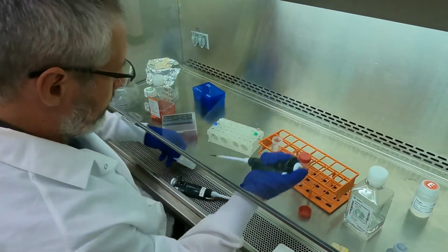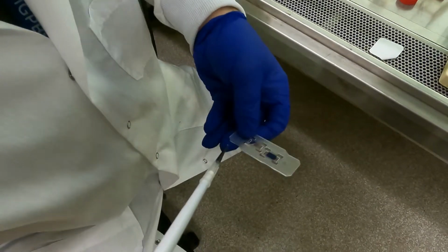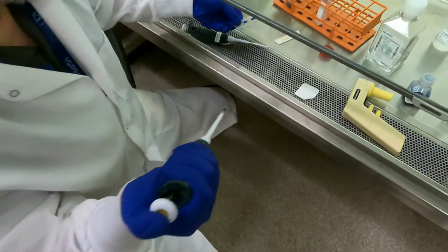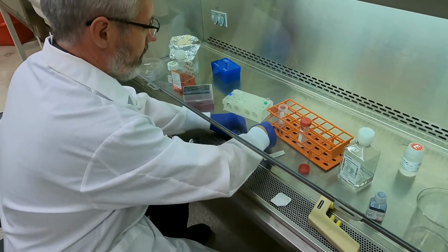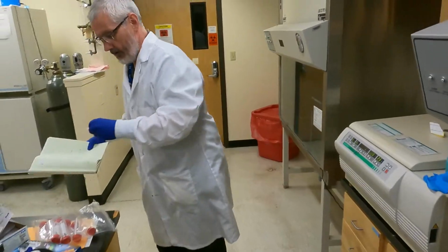Now, when you look at this hemocytometer, we just need to slot it in like this, watch, and then like that. And then the other side, like that. Okay, there we go. Now we're going to take this upstairs and we're going to get an accurate count. And we'll need a lab book to write it down. That lab book. And we should be alright.